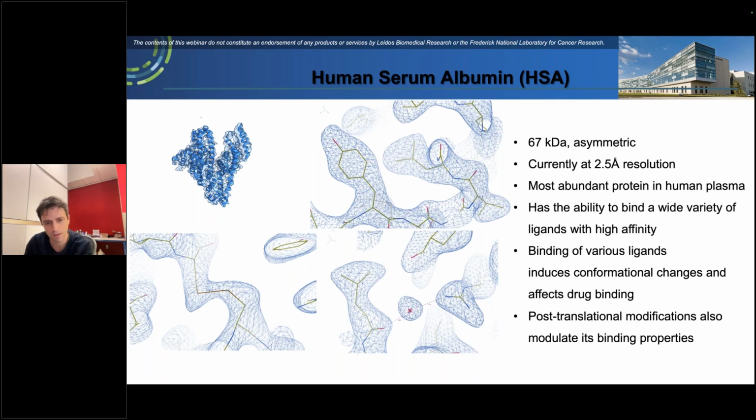And we talk in the lab about what the resolution limiting factor is for this particular sample. The consensus in our group is that the microscope is not the limiting factor, right? I think that we've proven that. So I think that we've settled on the resolution limiting factor being the flexibility of the protein. Obviously, there's other things that we can do with better grid making and that kind of thing. And we're exploring things in the processing to get rid of some of the conformational heterogeneity. But obviously, the problem is, it limits your resolution a bit. So for right now it's at 2.5, but we have every expectation that it's going to go higher than it is right now, and hopefully we'll be able to get it to sub 2 angstroms before too long. But for right now, it's stuck at 2.5.